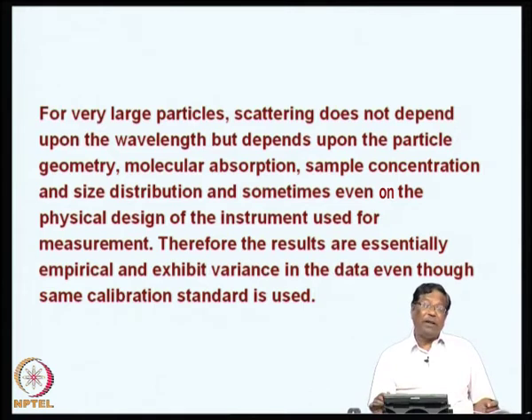Therefore, such a condition requires that every time you do a scattering measurement, you need to have a reference, and that reference value also will change, but it will be applicable only under the conditions of the experiment in which the sample and the reference are measured simultaneously or side by side.